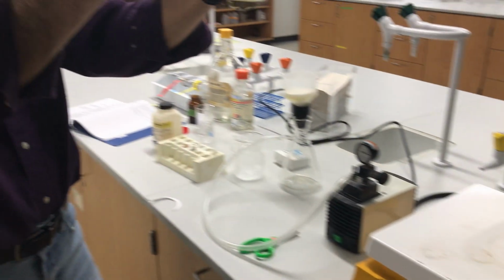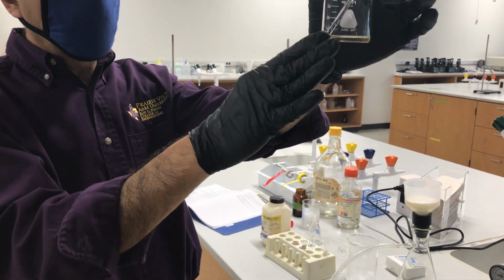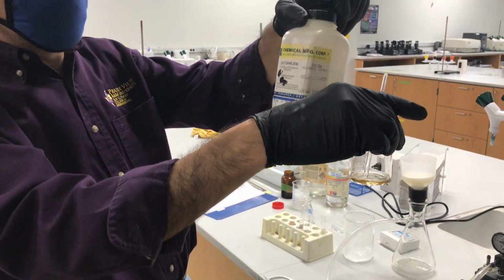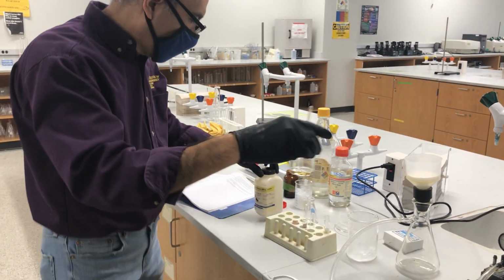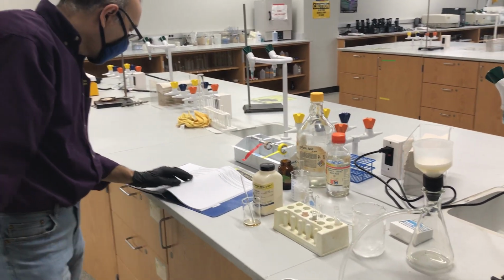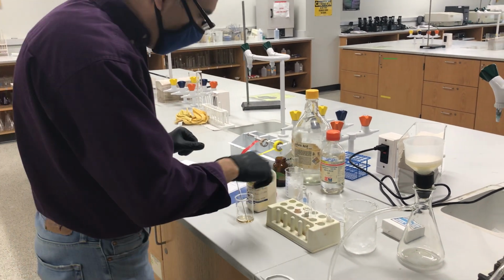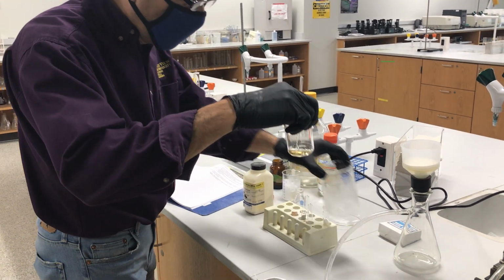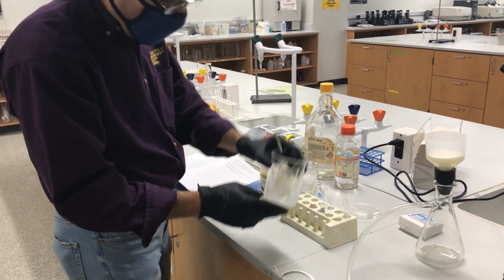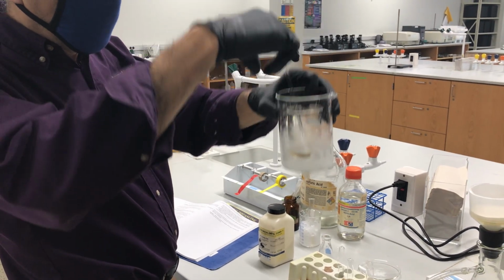Okay, now it is soluble, as we can see over here. So what we have here is the sulfuric acid and our compound, acetanilide. Let's look at the next step. They said we just have to cool it down a little bit. So we have ice over here, and I'm just trying to cool it down.